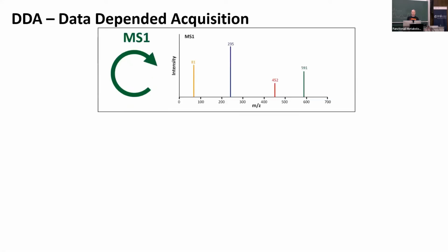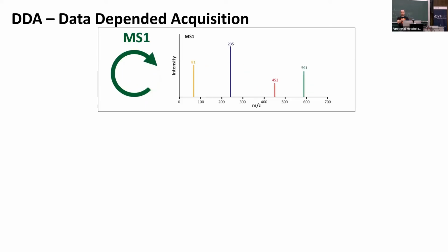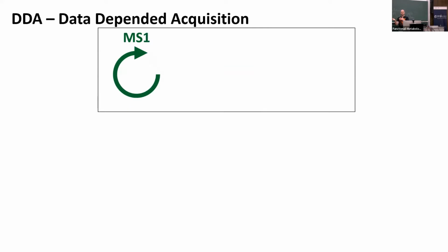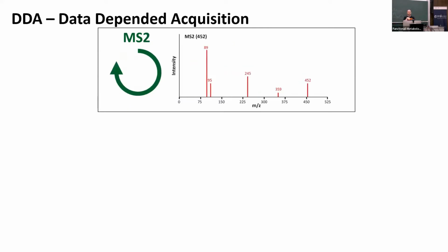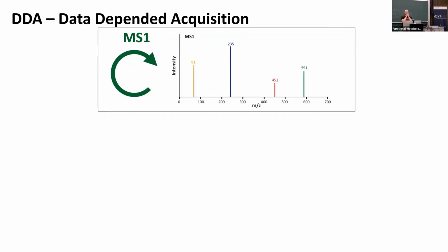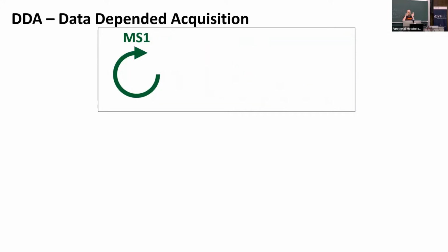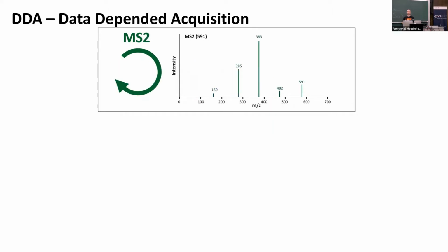But yeah, so again, we want to set up a data-dependent acquisition method. And I'm going to reiterate on that because that's a really important take-home message for us. Data-dependent acquisition basically acquires MS spectra depending on what MS1 masses are observed, right? And it cycles through duty cycles in which it does one MS1 precursor scan. And then depending on what peaks there are, it subjects those to the next MS events.